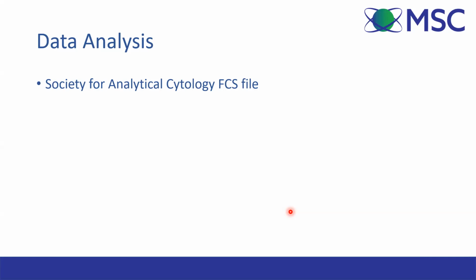Typically, a single cell analyzed for 4 parameters will generate about 8 bytes of data. So if you measure 10,000 cells, each FCS file will be about 80 kilobytes. So you can see that over time, storage space is also an important concern for flow cytometrists. Once your data is saved, there are different analysis packages which you can use to look at it, and delve into detail of the different populations, etc.